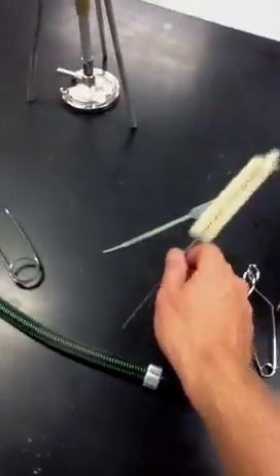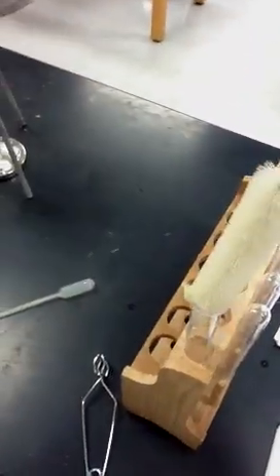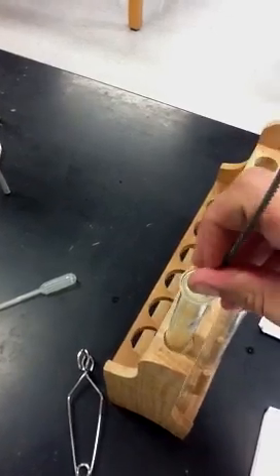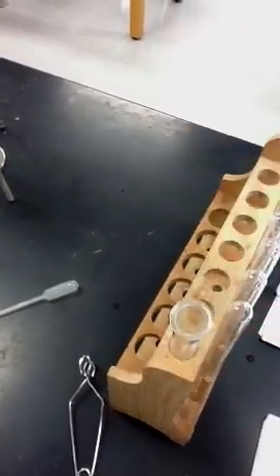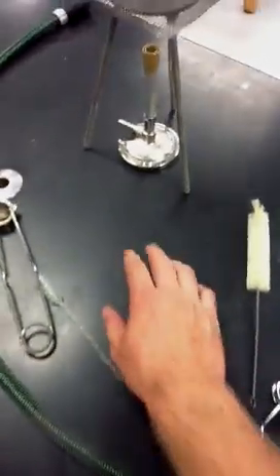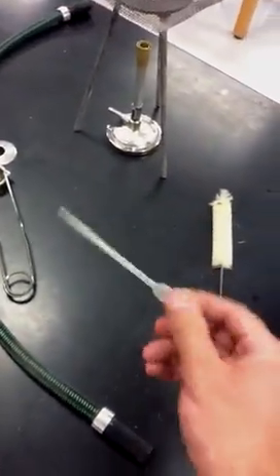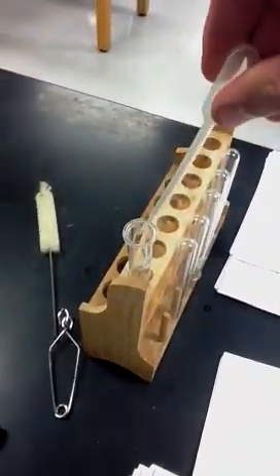We also have the test tube brush. This thing is used to clean the test tubes — you put it in there like this, stir it around, and eventually take it out and it cleans all the gunk out of it. You're supposed to use two hands. This thing here is called a pipette. It's used to get liquid and put it into test tubes — like drops, stuff like that.